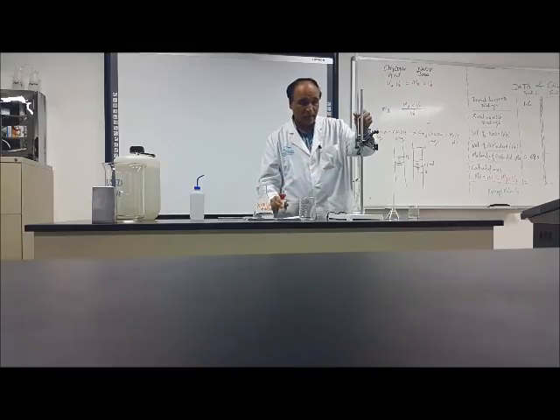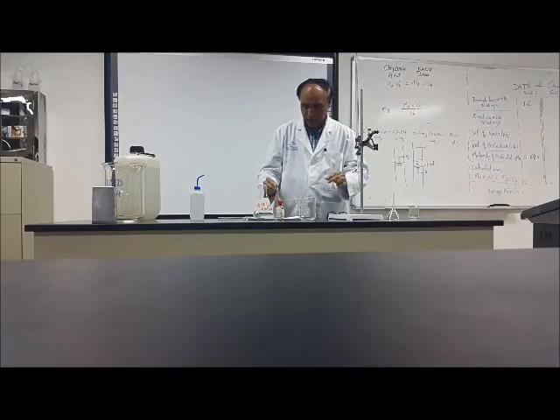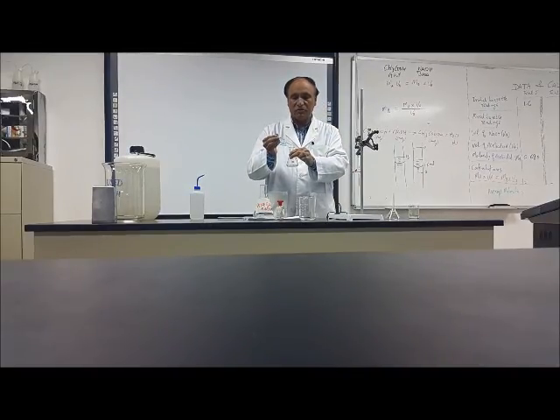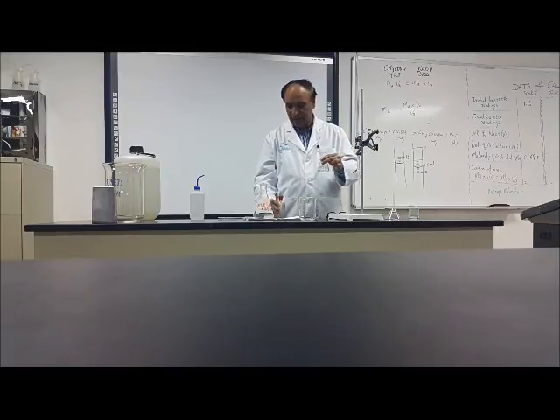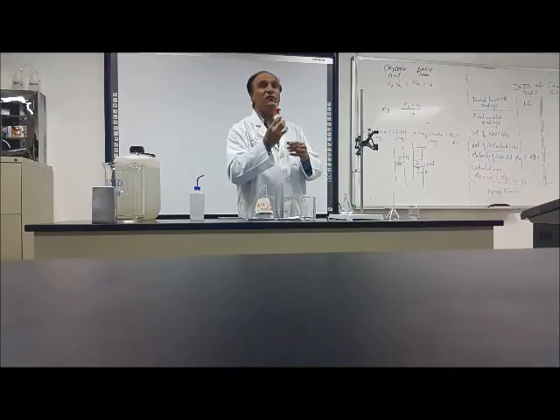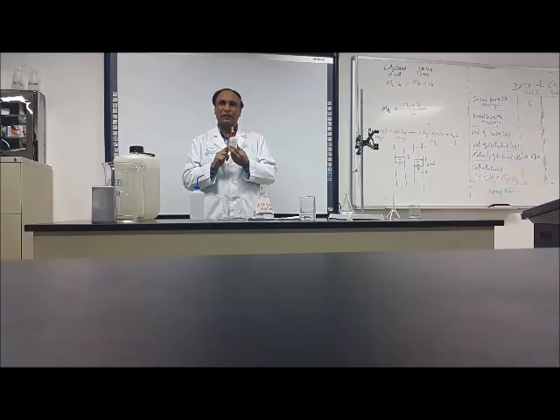Okay? And I will put this indicator, 1, 2, 3, 4 drops, up to 4 drops. And this indicator is phenolphthalein. What is it? This is phenolphthalein.